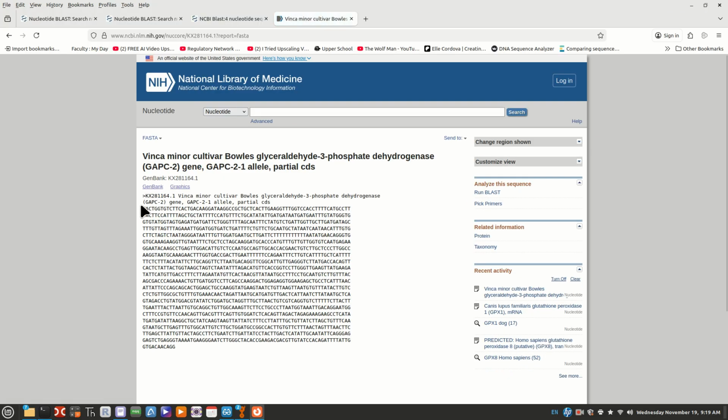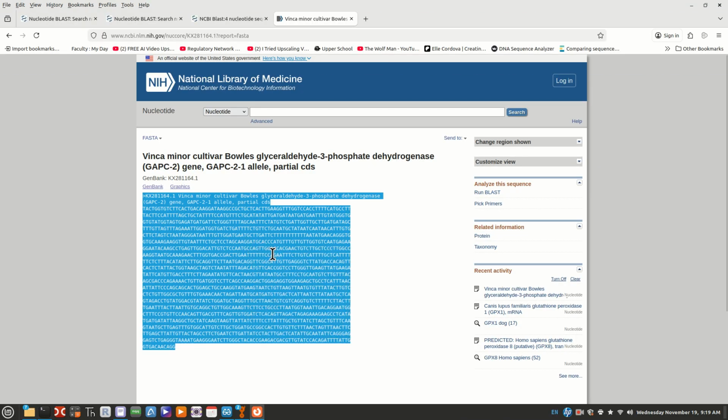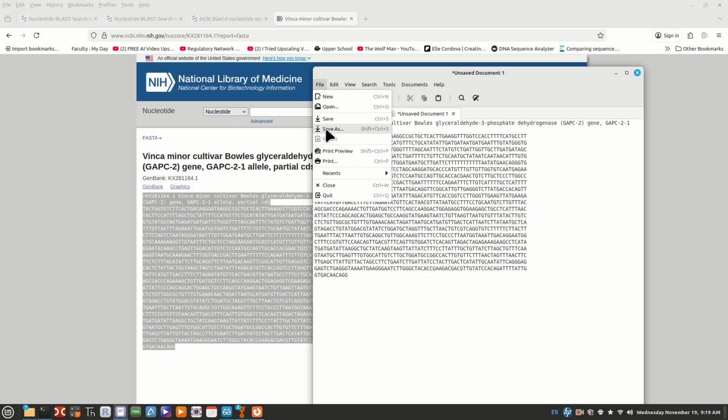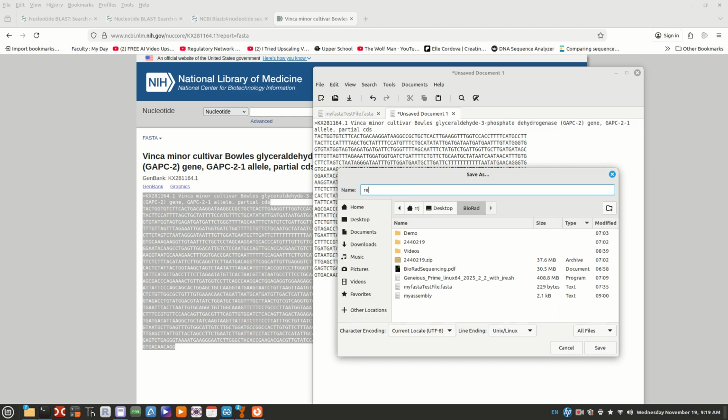Okay, so here is the FASTA for this one. I'm actually going to save this. I'm going to do it the old-fashioned way here. I'm just going to do it real quick. I'm going to grab this. I'm going to go copy. And I'm going to go back up here, and I'm going to make a FASTA. And I'm going to save this. Alright, as a result. Okay, and I'm going to save it here inside our folder, Biorad.